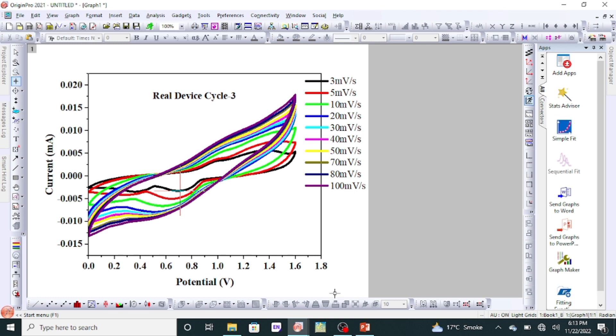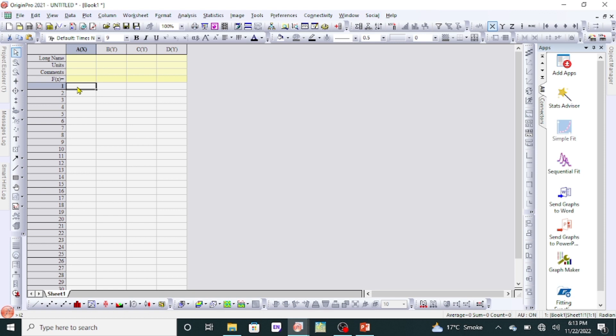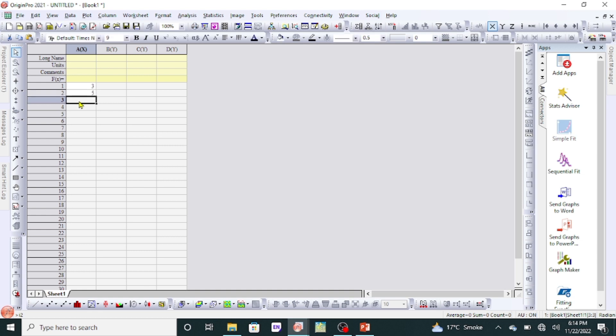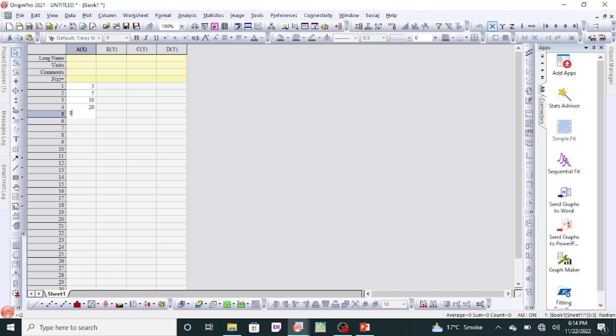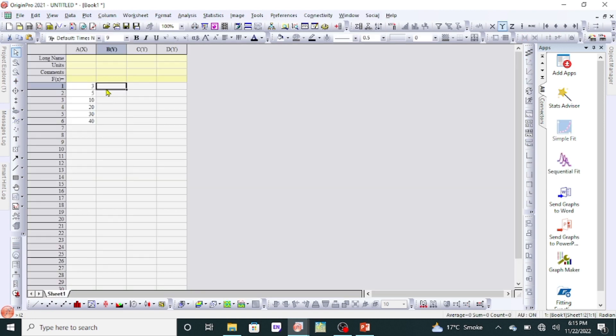Now go back to Origin and write this value. I have taken the values of current at 0.7 volt at the scan rates: 3, 5, 10, 20, 30, and 40. On the y-axis, we will write the values at different scan rates and fixed voltage 0.7.